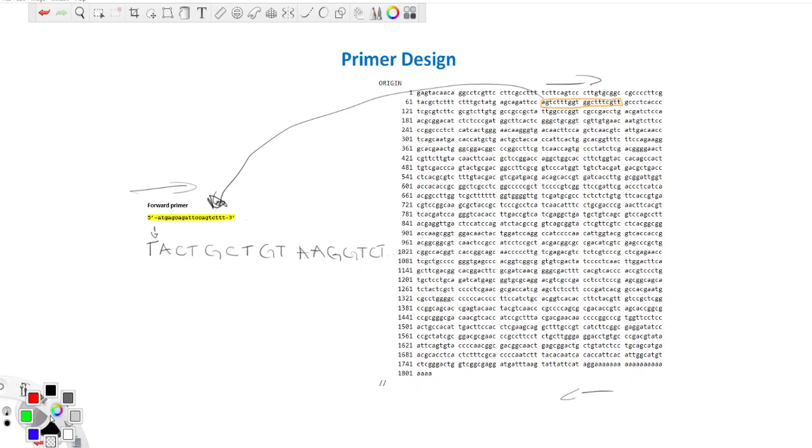So with this bottom part, let me select the right sequence. I'm going to get from this region here up to this one, and hopefully these are the 20 sequence. If you just give me a moment there, I'm going to select that for us. And once we have the region, then we are going to actually get our DNA strand.